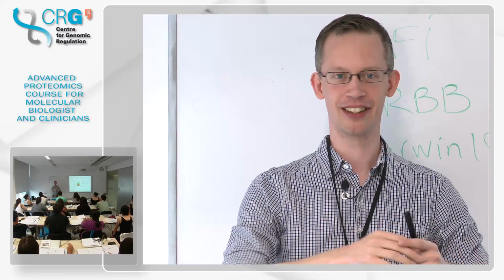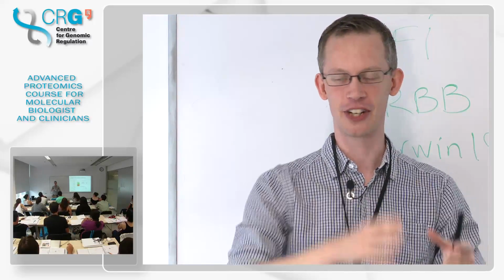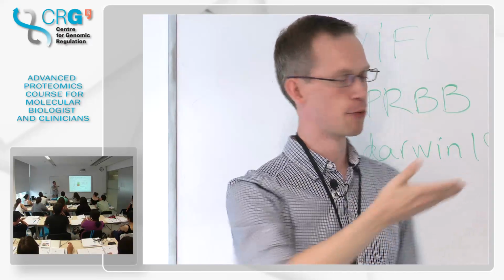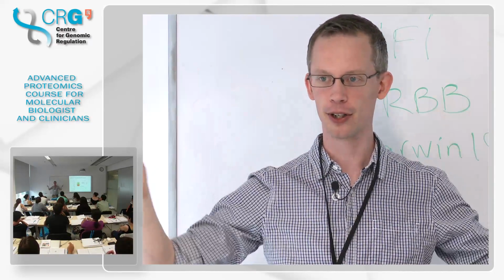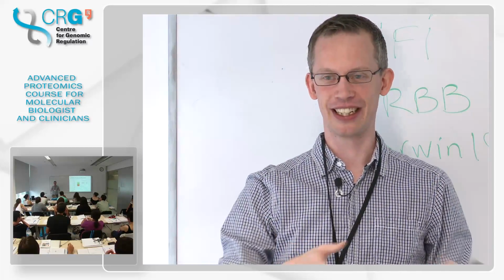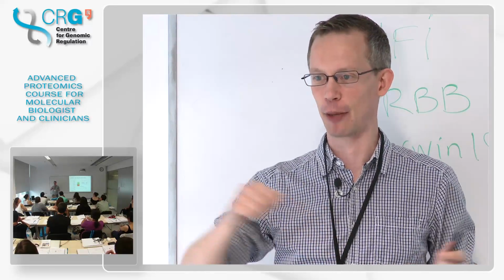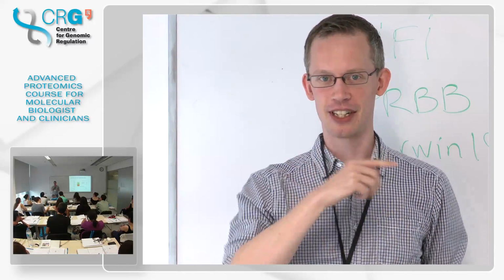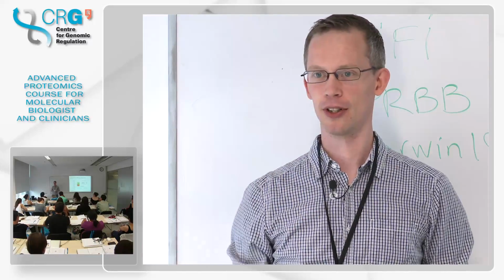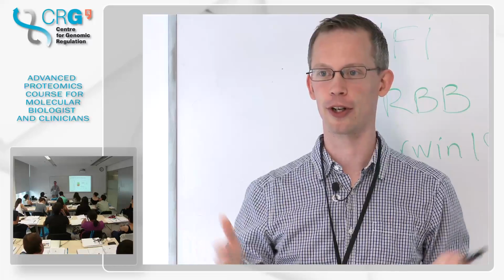and do the exercise you did yesterday on that particular finding. But you probably don't want to spend all your time on that. The good thing is that we can have objective criteria for when something is identified, not based on an individual sitting and trying to figure out how it probably fragments and what is probably true. This is more objective than having an individual go through all of them, and you can control your errors in this way.